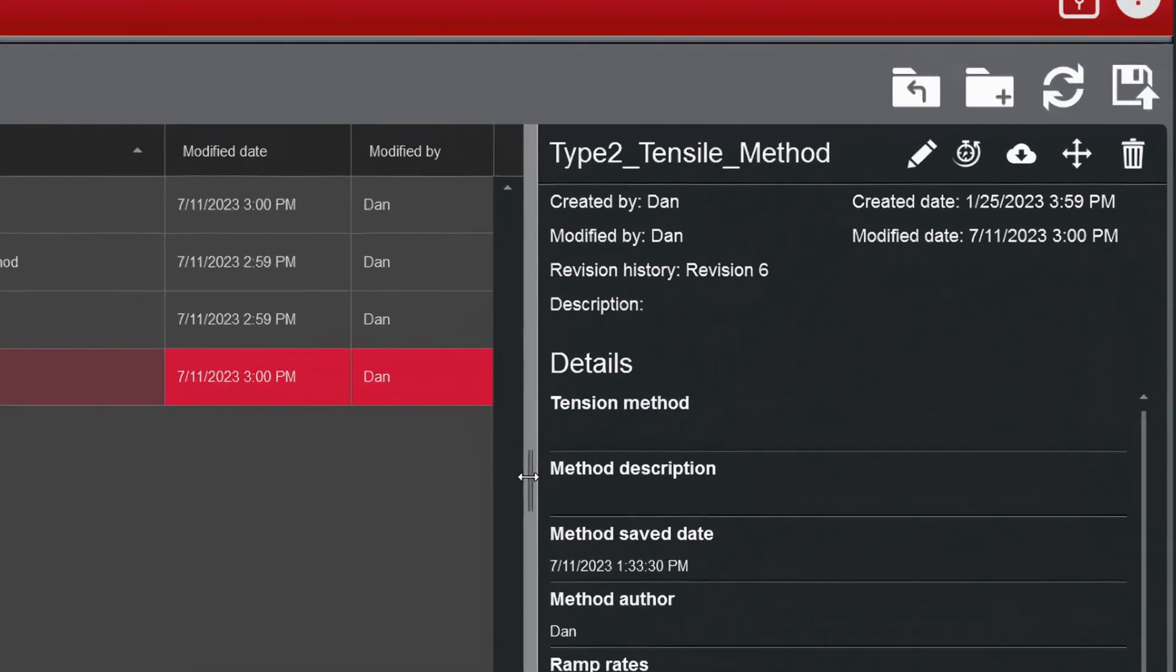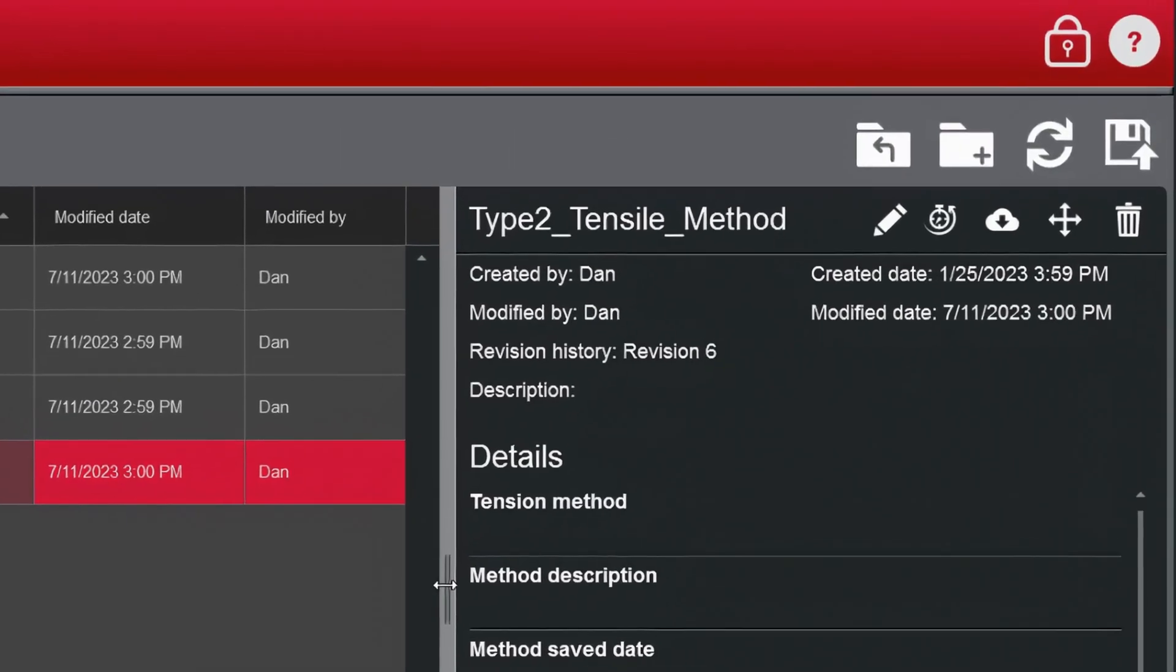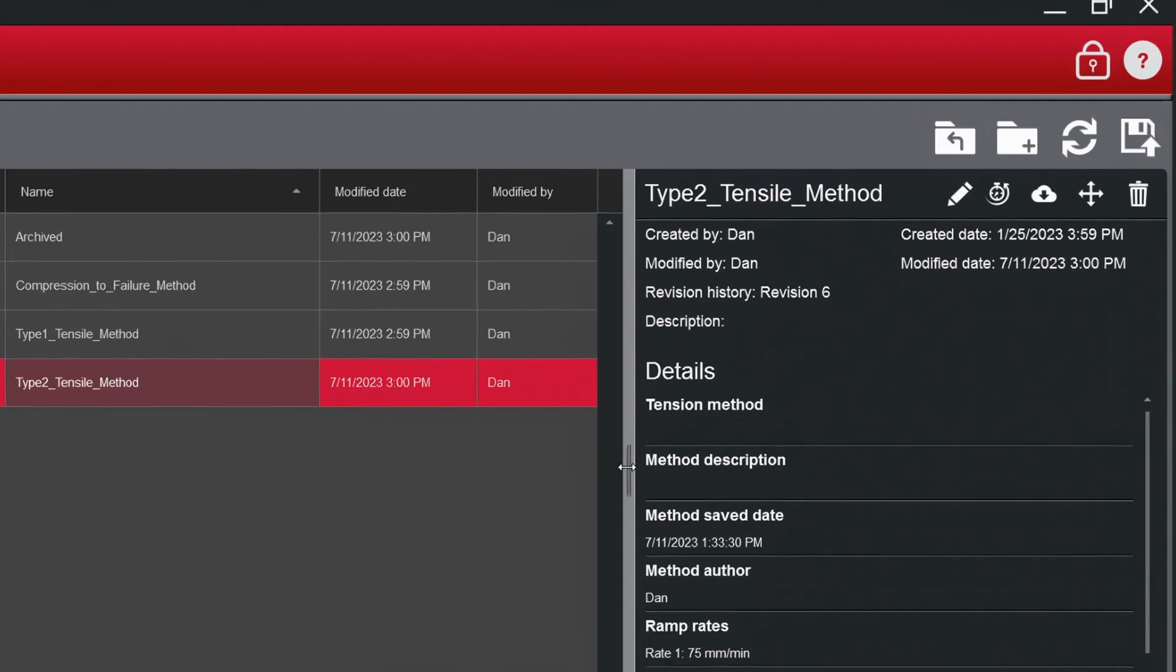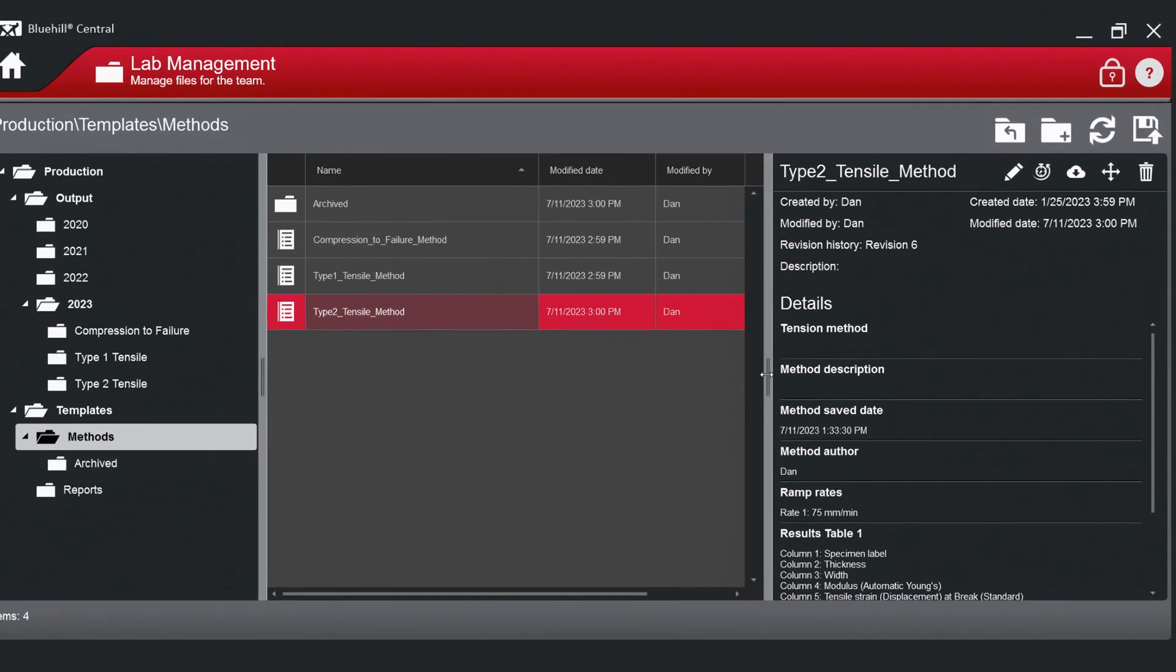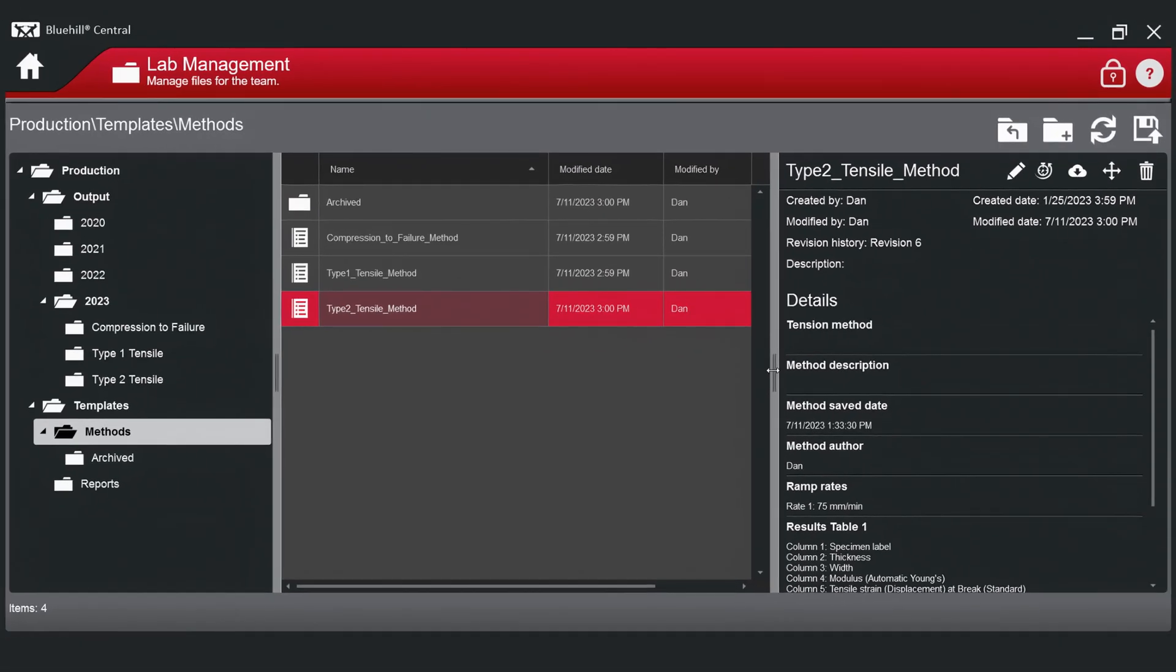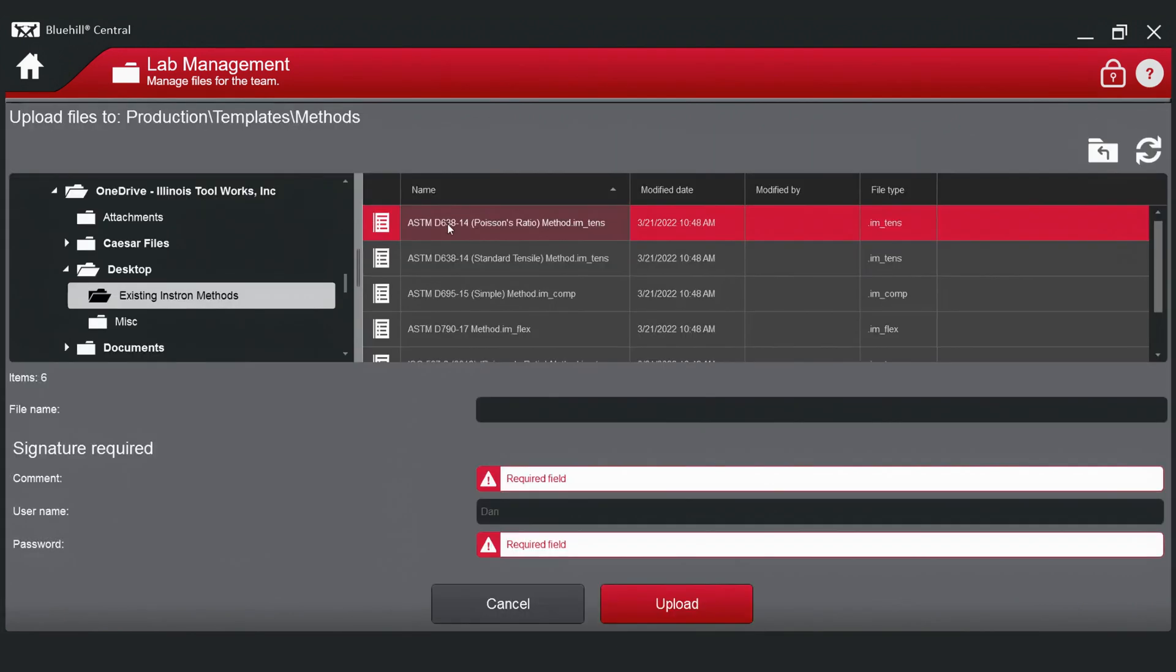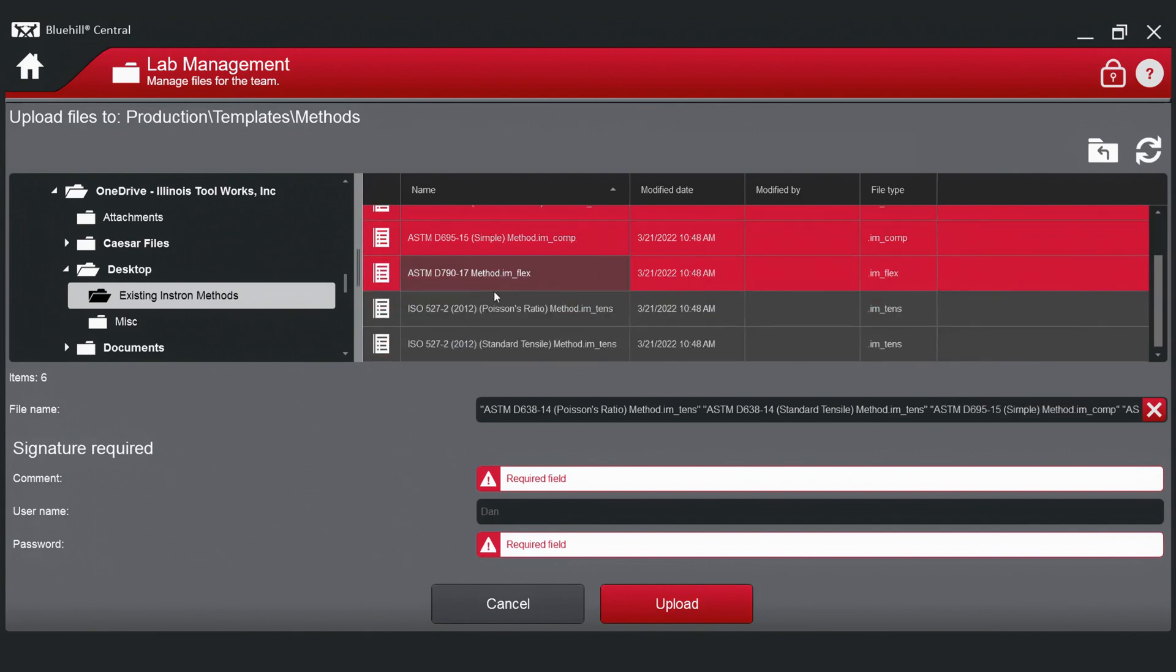Adding a new folder is done by clicking on the create folder icon in the upper right corner. To save files to the database, you can either generate and save them from Bluehill Universal, or you can upload them from your local Windows file system into Bluehill Central.